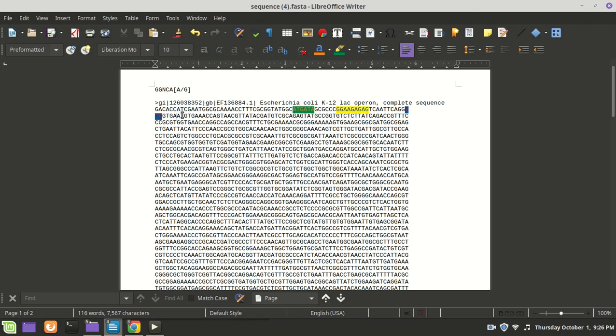So 1, 2, 3, 4, 5, 6, 7, 8, 9, 10, and then we're going to go just a little bit further. So 770, 840, 910, 980, 1050, and then 70 more. Yeah, it's going to be right in here.